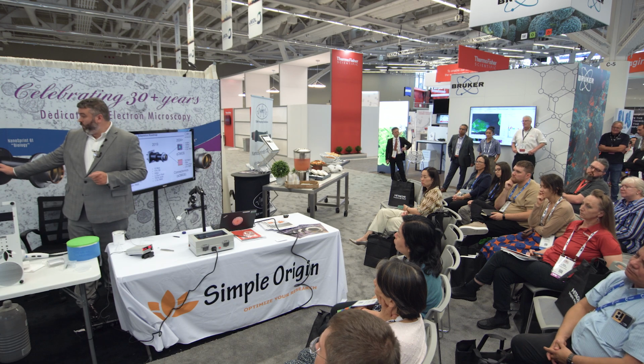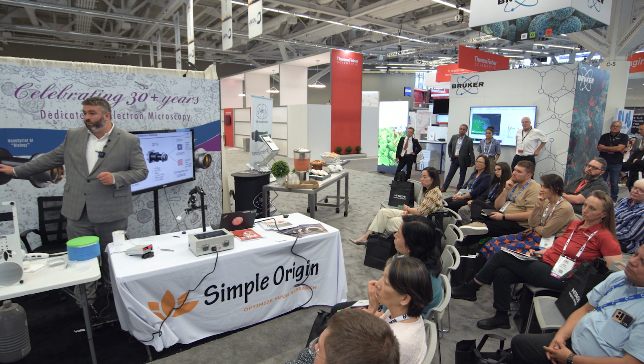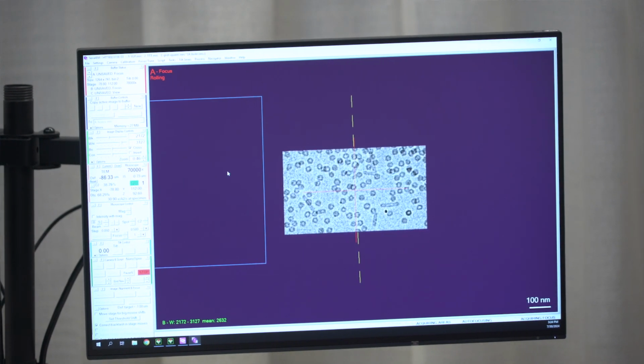And so Heather's system is running now. I think we're probably running with an exposure of like 400 milliseconds, and you have great grayscale. And that's what it translates to in real time.